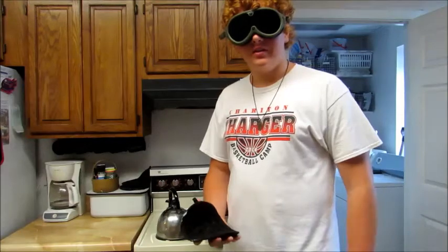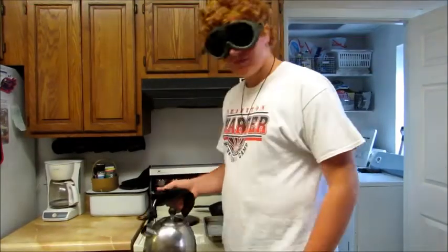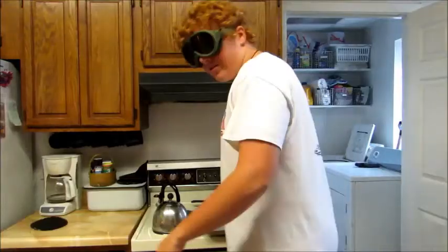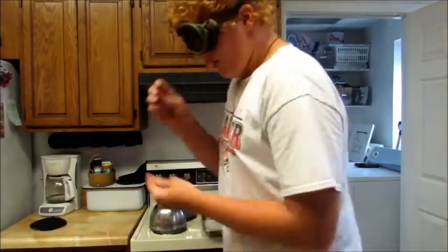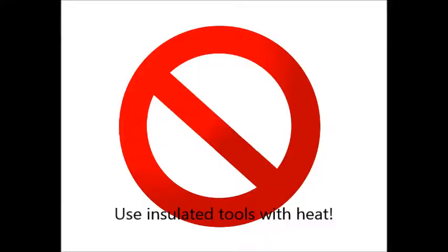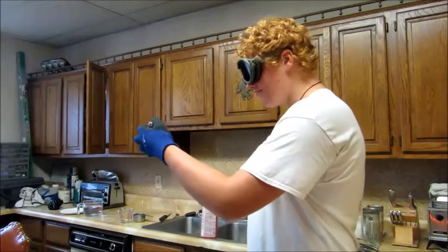Use appropriately insulated things while picking up heated objects. Oh, this probably isn't hot enough. I'll just pick it up with my... Oh, that's hot. That burns. Keep fire away from flammable objects. But fire is so fun.